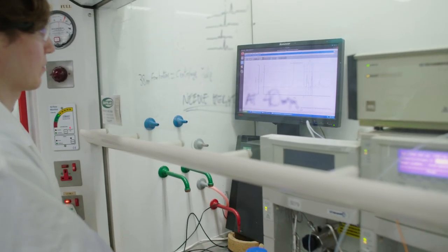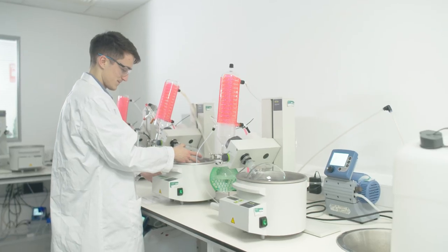We'll quite often work with a client and they'll send us 72 mg of a compound to purify. We'll separate it into the isomers and return it.